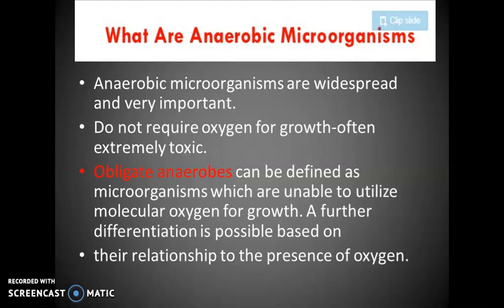These anaerobic microorganisms are widespread and very important, and they do not require oxygen for growth. Often oxygen is extremely toxic for the anaerobes. Now, obligate anaerobes can be defined as microorganisms which are unable to utilize molecular oxygen for growth. A further differentiation is possible based on their relationship to the presence of oxygen.